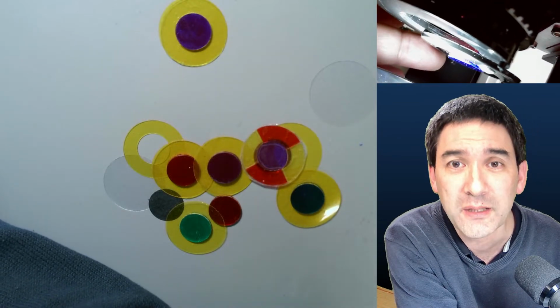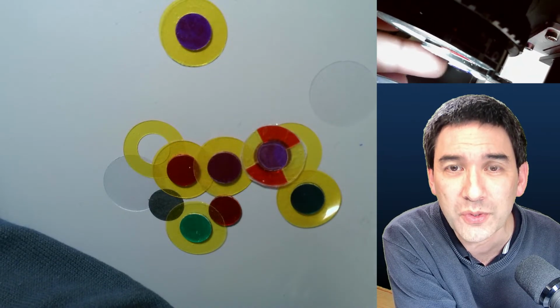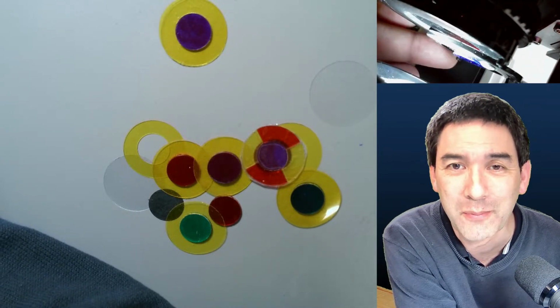Sometimes I even got emails. Some people were not able to see anything because the filter was stuck halfway and the ring of the filter blocked the light, and they thought that the microscope was broken.